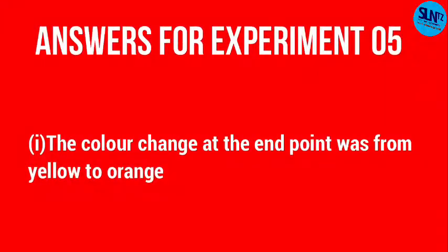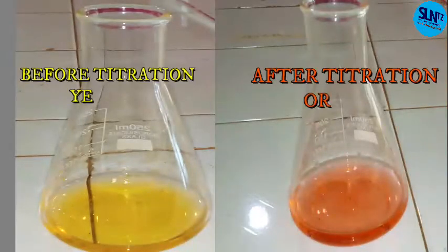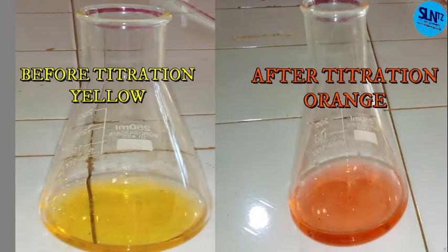Another question: the color change at the end point was from yellow to orange. So the first color was yellow, and then at the end of the titration, the color changed to orange. That is the color change.